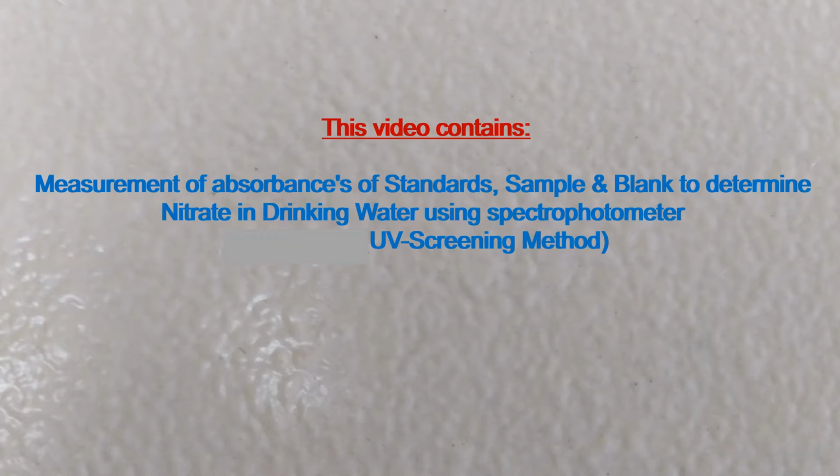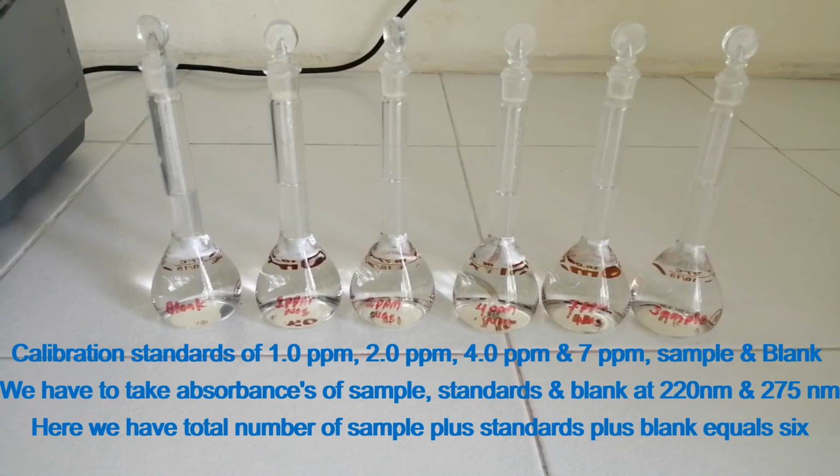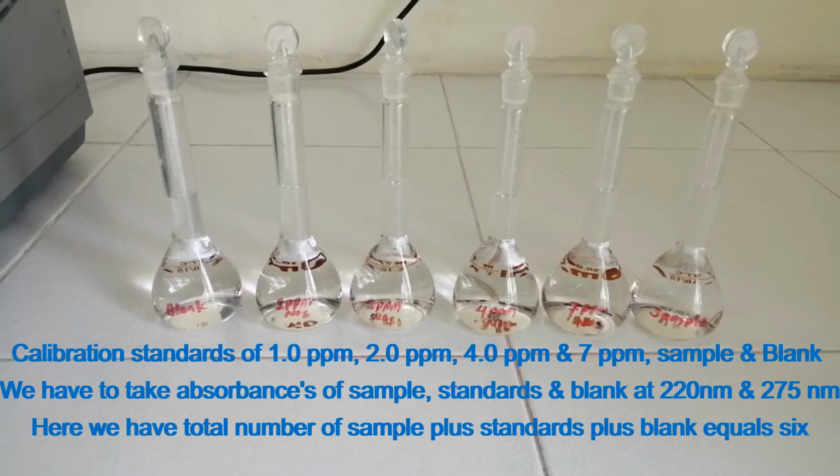This video contains measurement of absorbances of standard, sample and blank to determine nitrate in drinking water using a spectrophotometer by the UV screening method. These are calibration standards of 1.0 ppm, 2.0 ppm, 4.0 ppm and 7.0 ppm, sample and blank, which were already prepared. Now we have to take absorbances of sample, standard and blank at 220 nanometer and 275 nanometer. Here we have total number of sample plus standard plus blank equals 6.